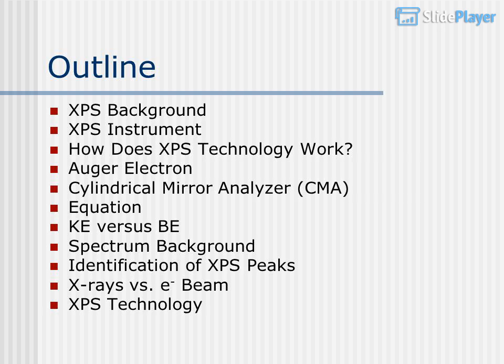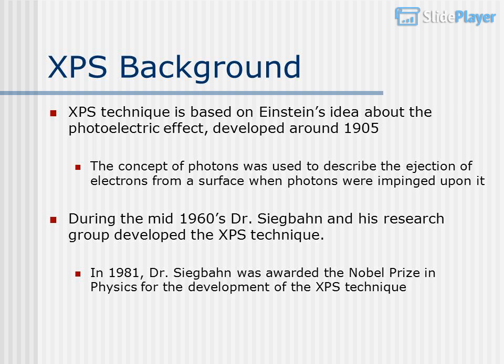XPS technology. XPS background. The XPS technique is based on Einstein's idea about the photoelectric effect, developed around 1905. The concept of photons was used to describe the ejection of electrons from a surface when photons were impinged upon it. During the mid-1960s, Dr. Siegbahn and his research group developed the XPS technique. In 1981, Dr. Siegbahn was awarded the Nobel Prize in Physics for the development of the XPS technique.